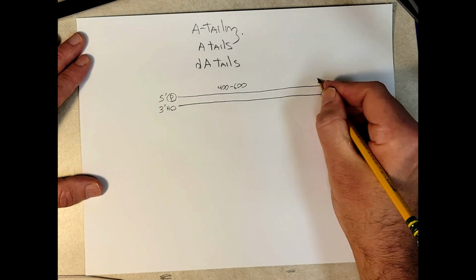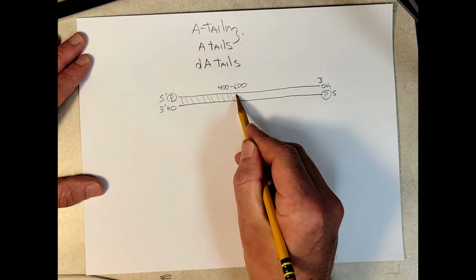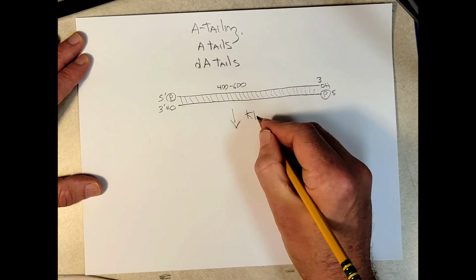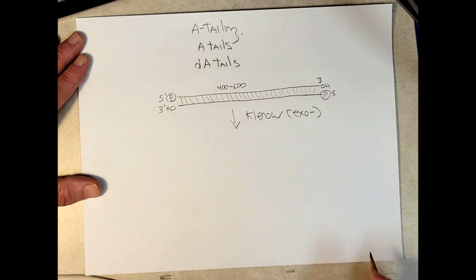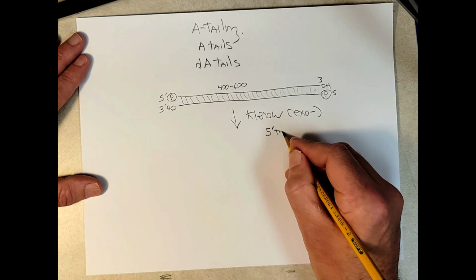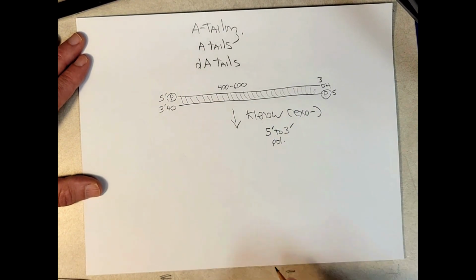Now, ideally they all look like this. Okay, so now what we're going to do is use an enzyme that we already talked about, Klenow exo minus. So this Klenow exo minus, what does it have? The only activity it has left is the 5' to 3' polymerase activity.